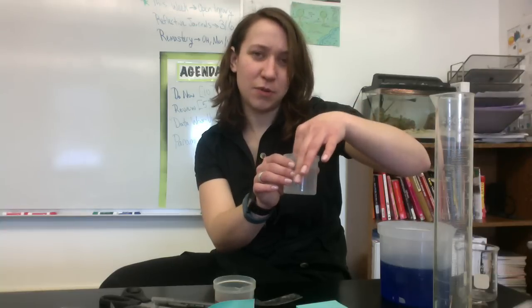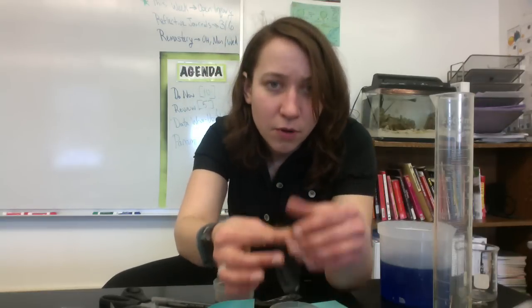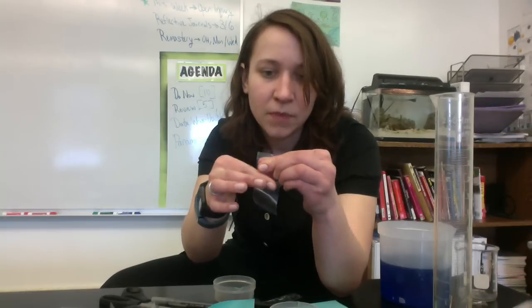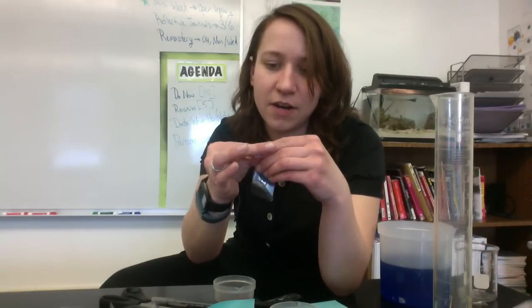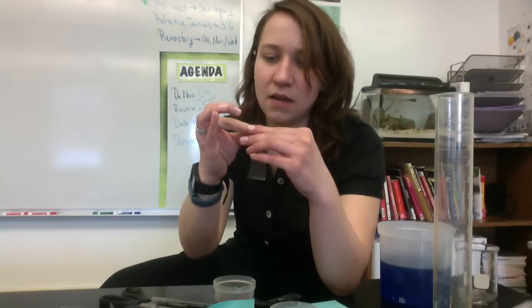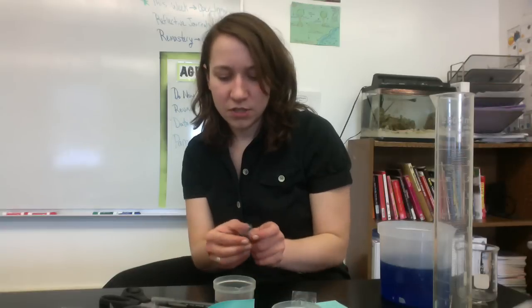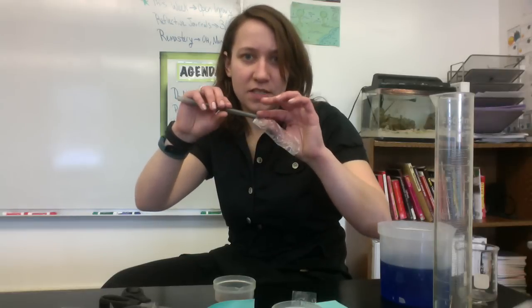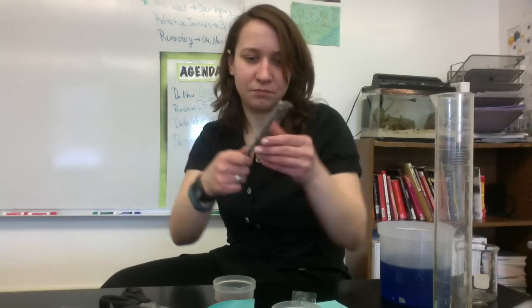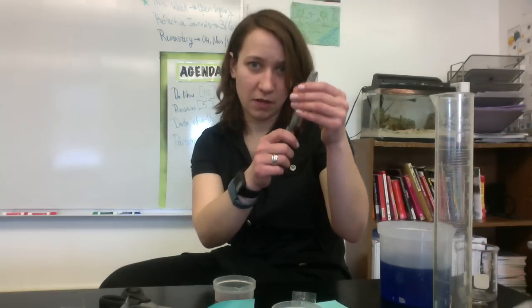Dialysis tubing is not super easy to work with when it's dry, so you need to get it kind of wet. Then what you're going to do is rub it back and forth between your thumb and forefinger until you can get a little opening at the top. This does take a little effort. To save some time, I have done one before we started. Once you get it open — just a little tip open at the top — take a pencil, pipette, or toothpick, stick it into that tip, push it through, and move it back and forth to really open up the dialysis tubing. Now it went from being a flat strip to being more like a little tube, a little bag that we can use.